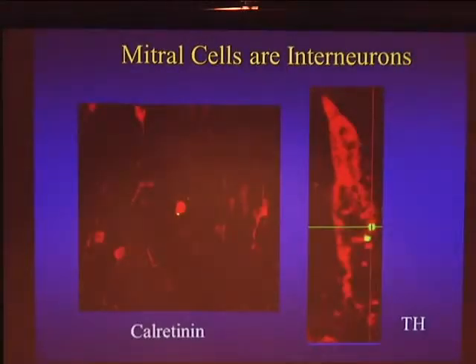If you do the immunohistology, the cells that have particles look a lot like the granule cells, if you know about these new neurons. They're calretinin positive, so there's a new calretinin interneuron with one of our particles in it. And they're tyrosine hydroxylase positive. These interneurons will make dopamine. And so here's blown up now for you a new TH positive interneuron. This one has a couple of particles in it as well. So we're very excited. We think we can watch the migration, count the cells, and follow them into the bulb. Okay.